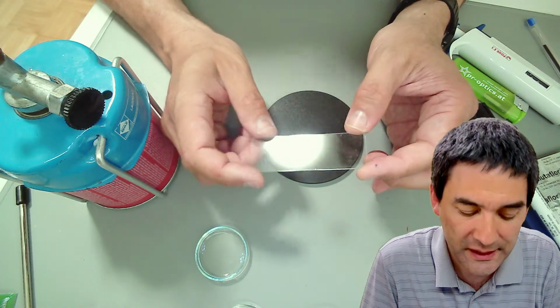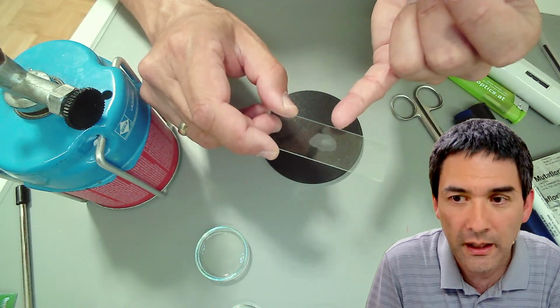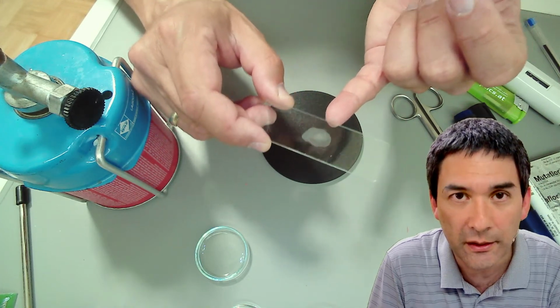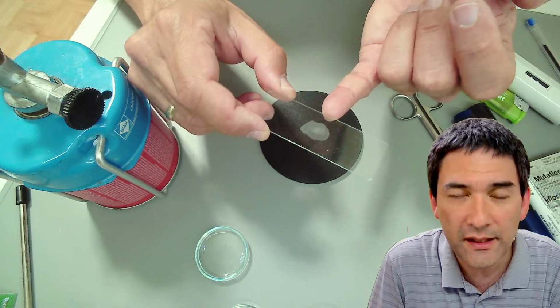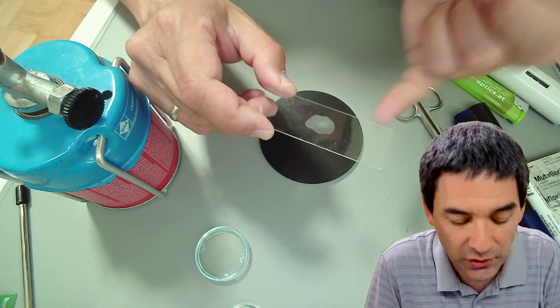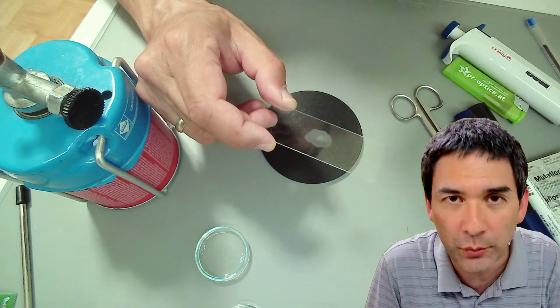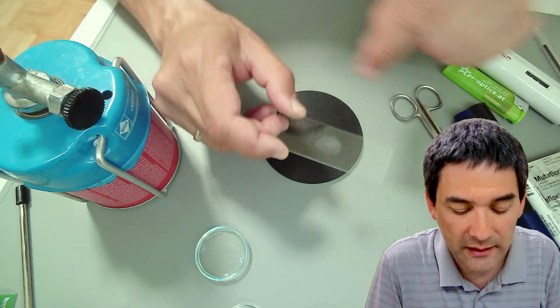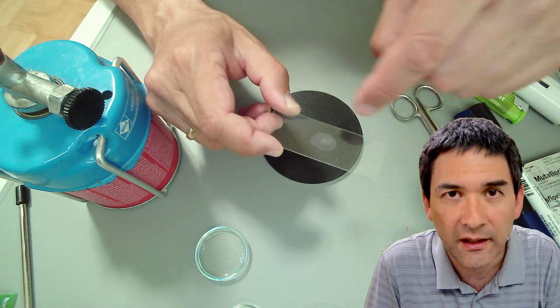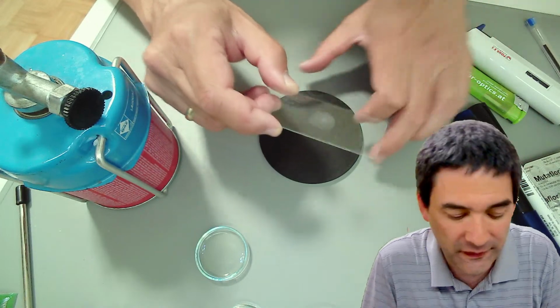So what I'll be doing is pulling the slide with the specimen through the gas flame to heat it up. This will cause the bacteria to form cross links to the slide, and they will stick a little bit like an egg in a frying pan, which sticks. And that's important because then I can add the stain without the cells being washed off. That's why heat fixing is important.